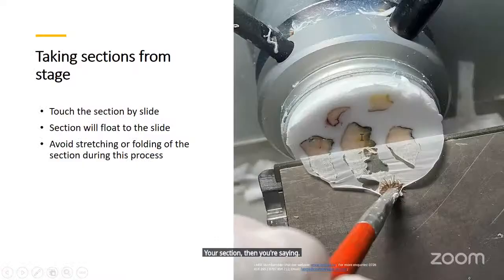This is just a demonstration of how you collect the sections when you're doing sectioning on a cryostat. Once you section, you touch the slide.